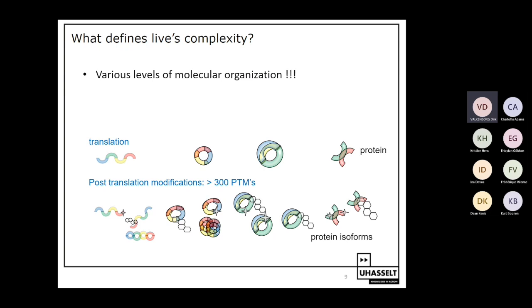So you can really see these as biological nanomachines that are constructed in a cell, and depending on the assembly of a protein in a complex, the function of the protein can differ. So it is a complicated matter, proteomics.